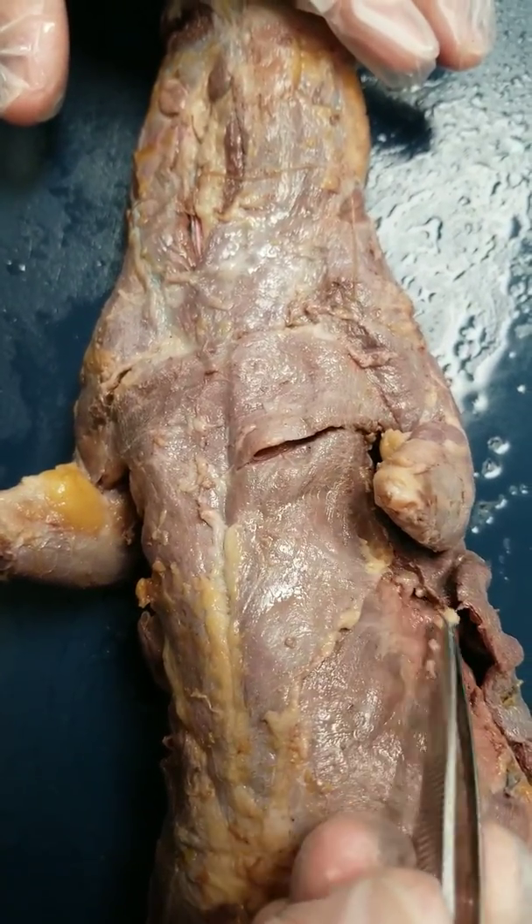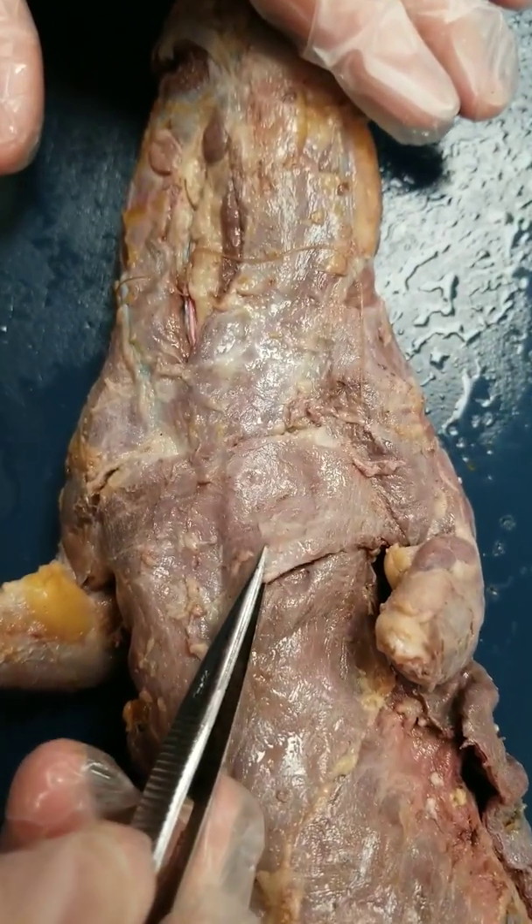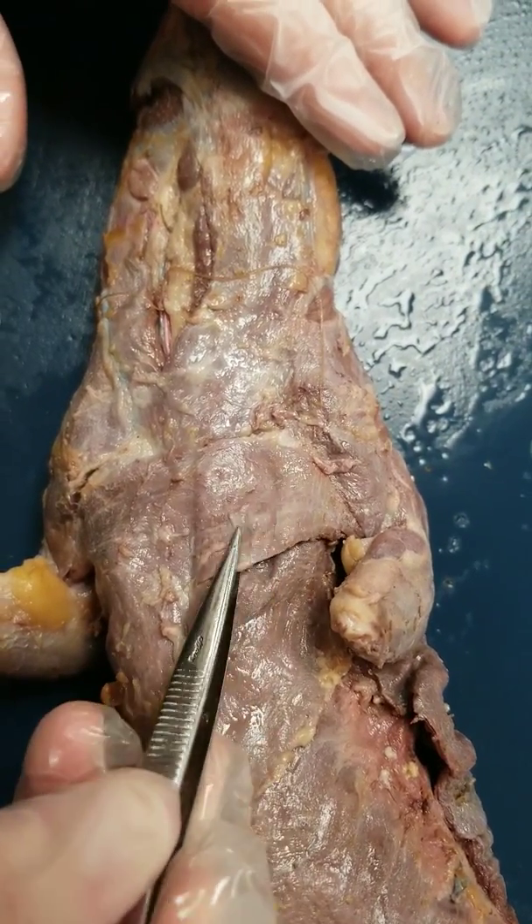You want to remove the fat as you go through. This is the pectoralis major muscle, and you just want to separate it from the minor and lift it up as well.